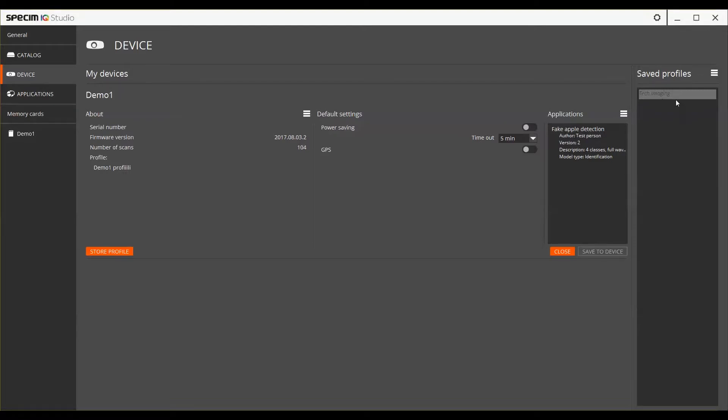You can also create profiles which are preset settings and application packages that can be installed to any iQ device you are using.